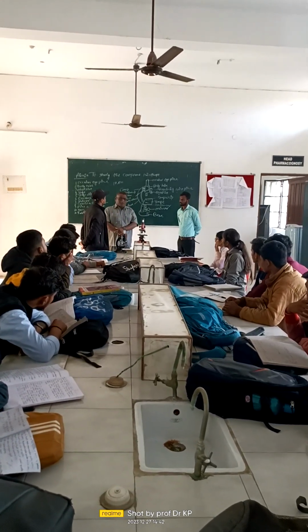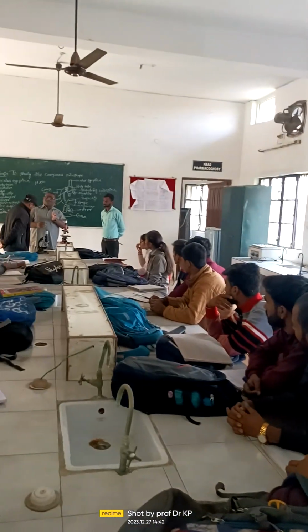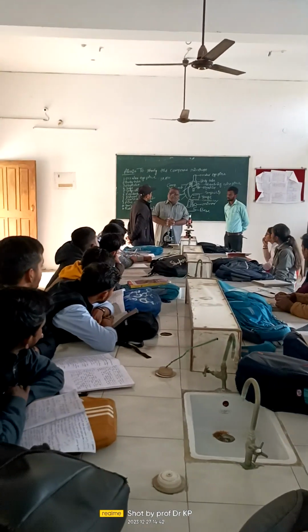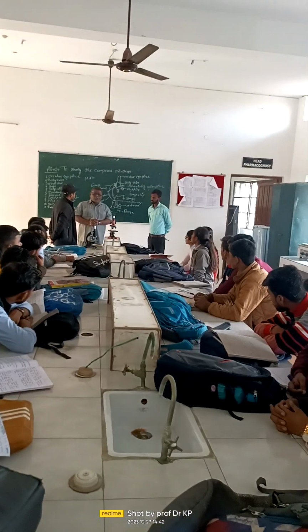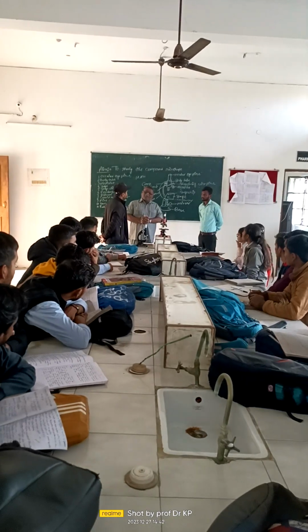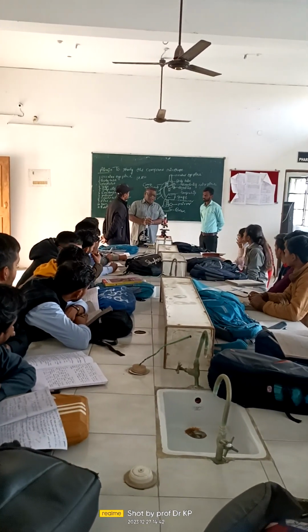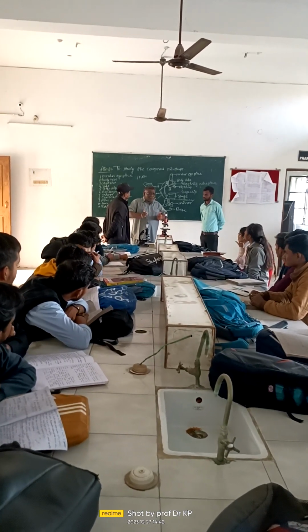There is a classification of microscope. Depending upon the generation and the advancement, the first microscope is the dissection microscope. What is it? The dissection microscope was used before, and still it is used, to enlarge the size of any material up to 10-fold.